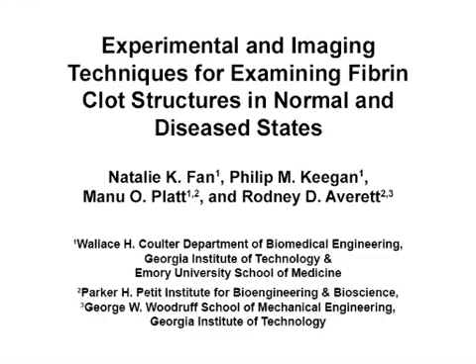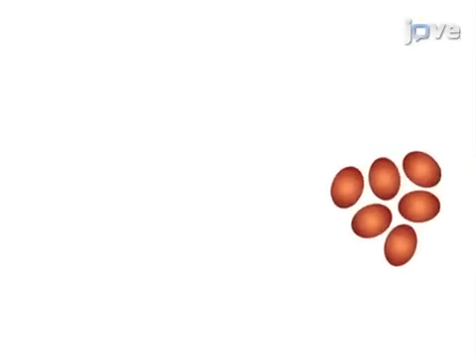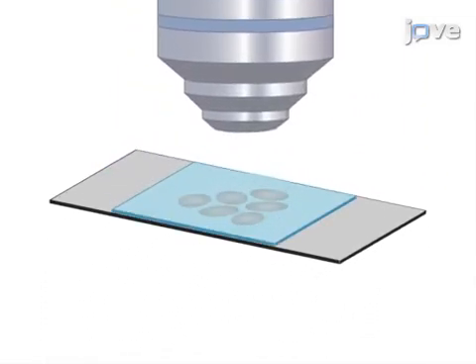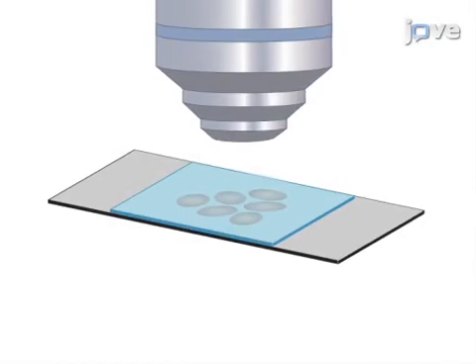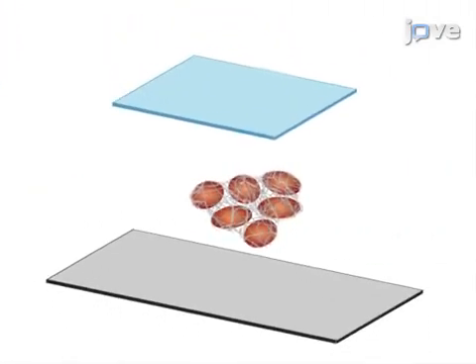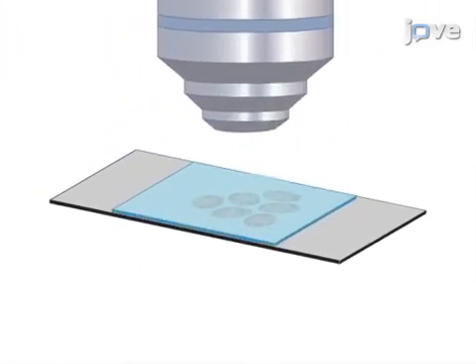The overall goal of this procedure is to examine the morphological differences in abnormal clot structures that occur in diabetes and sickle cell anemia disease conditions. For simulated diabetic clots, this is accomplished by imaging glycated clot structures by confocal microscopy. For blood samples from sickle cell patients, fibrin clots containing red blood cells are imaged.